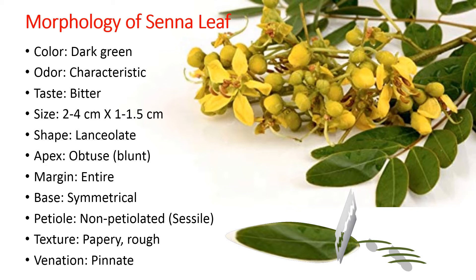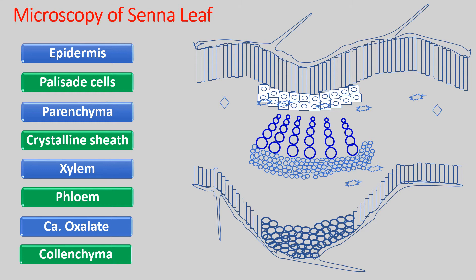The sections have both a lamina and a midrib attached to it. The microscopy of Senna leaves shows various different kinds of tissue. These include epidermis, palisade cells, parenchyma, crystalline sheath, xylem, phloem, calcium oxalate crystals, and collenchyma. We will have a look at them one by one, arranged from the periphery — that is, from the upper side towards the lower one.